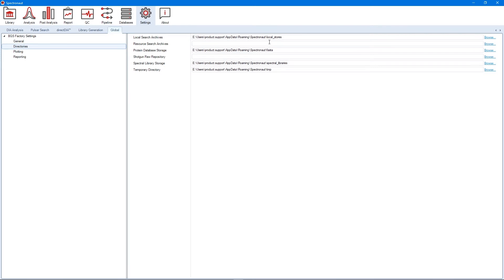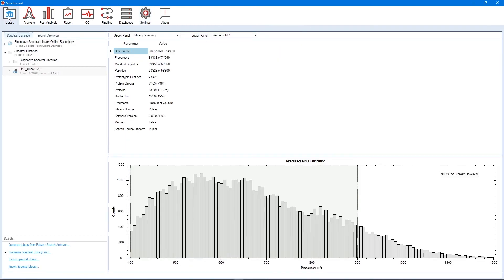The second option, as you might have guessed, is to first generate a library in the library perspective using your DIA runs, and then set up a traditional library-based DIA analysis.